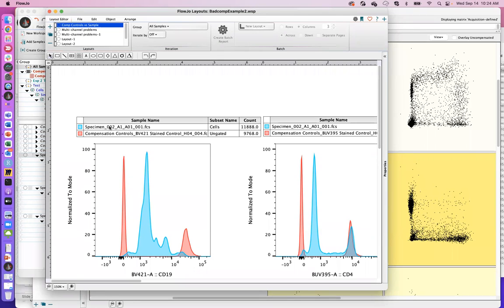And then the sample is whichever one. Generally speaking, you want to pick the sample that you expect to have the brightest cells in. So if you know that when you treat the cells with a particular drug that they're going to increase expression of X, Y, or Z, you probably want to overlay that sample with the appropriate single stain control.